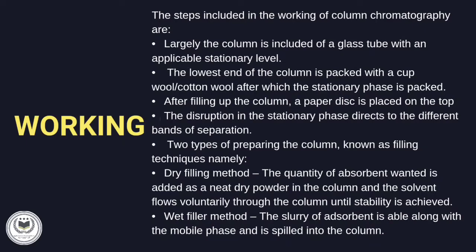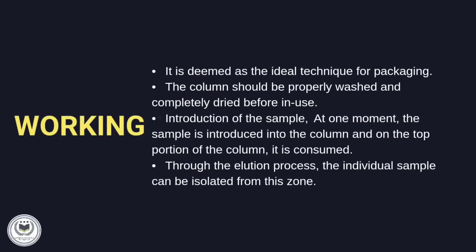And then there are two types of column preparation, known as filling techniques, namely the dry filling method and the wet filling method. Dry filling method. The quantity of adsorbent wanted is added as a neat dry powder in the column and the solvent flows through the column until stability is achieved. Wet filling method. A slurry of the adsorbent is made along with the mobile phase and is poured into the column. It is deemed the ideal technique for packing. And then the column should be properly washed and completely dried before use.